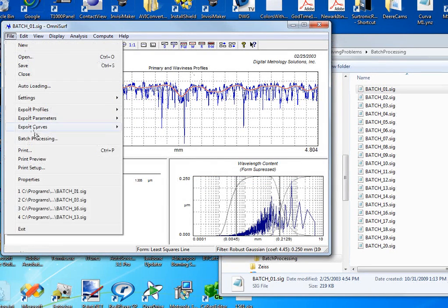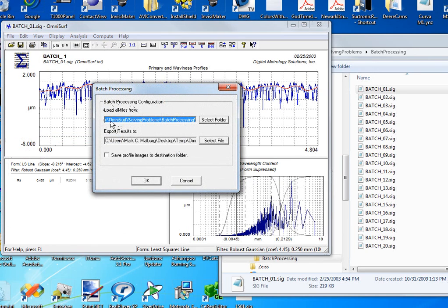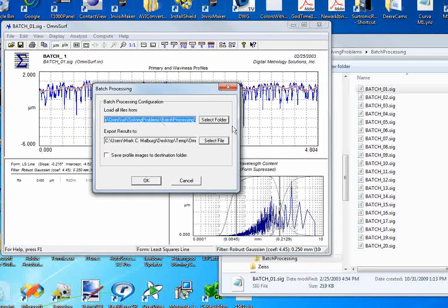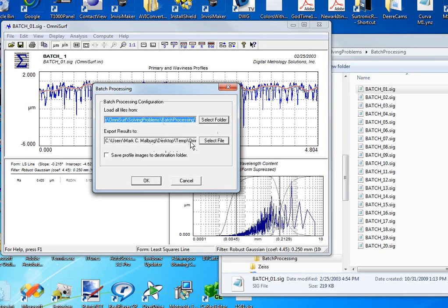Batch processing is one of those features that I get probably the most compliments on. The ability to load all the files from a given folder and export the results to a spreadsheet.